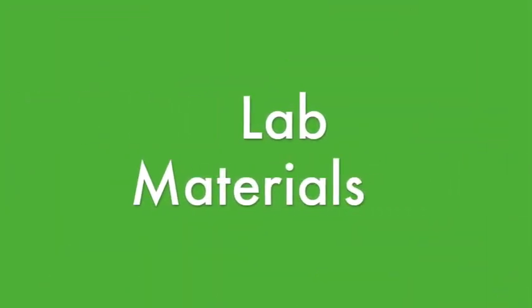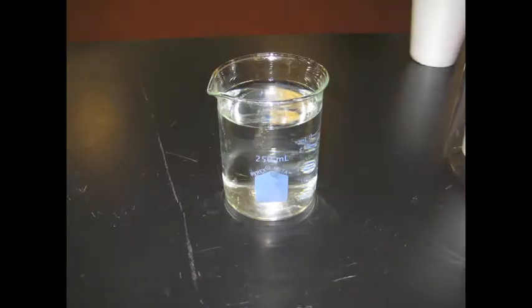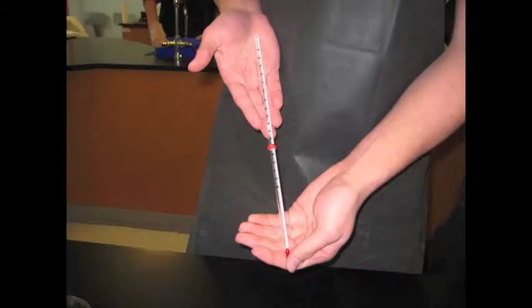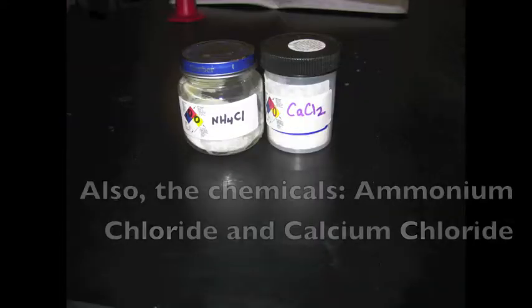To start off, you will need the following: 2 large styrofoam cups, 2 empty 600 milliliter beakers, 1 250 milliliter beaker filled with water, 2 spatulas, a graduated cylinder, 2 thermometers, an analytical balance, and 2 weigh boats.